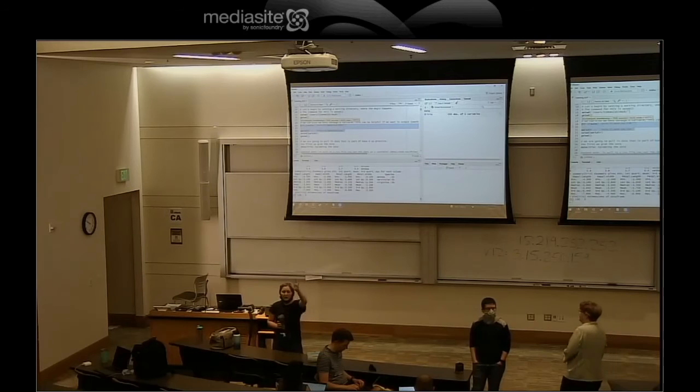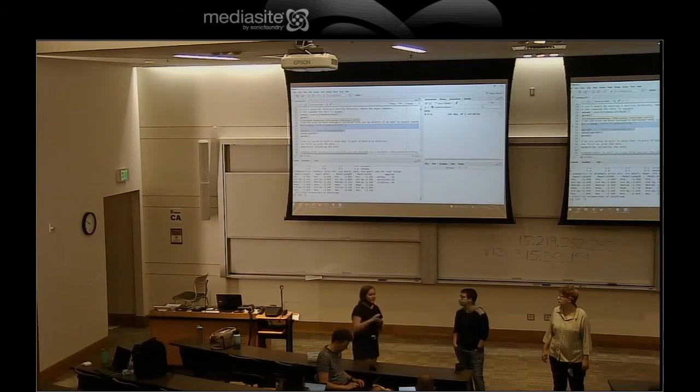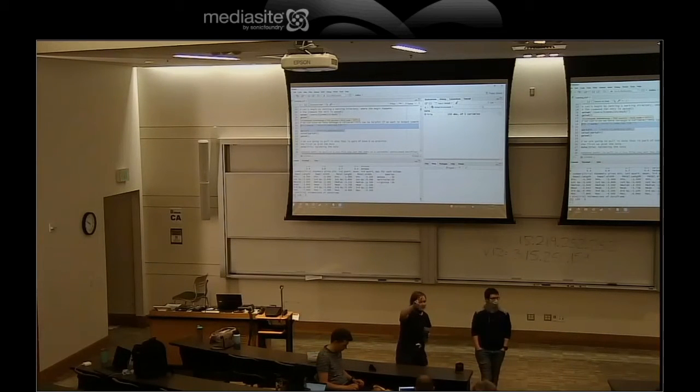If you're done with all 5 sections, that's when you put your yellow one up, and once enough people are there, or we hit around 11:15, we'll move on to feature counts where you can generate your count table based on your BAM files. Both feature counts and DESeq, the 2 programs we're running today and tomorrow, run on R. That is one of the reasons we are practicing R right now.